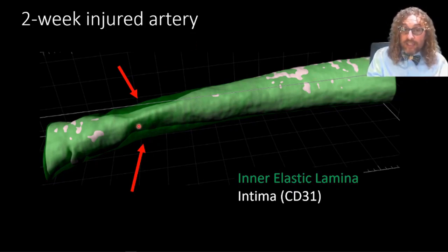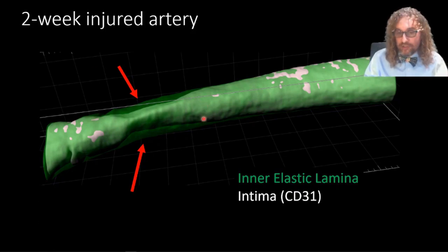So as you can see here, you don't have to select this cross-section or this cross-section to show your data. You can show the whole artery and show the total site of stenosis. However, still, selection of the region of interest where injury occurs, if you were to select that yourself by looking, would be subject to some user bias. So we decided to come up with a method to minimize that and automate this process of selecting where injury starts and where injury ends.